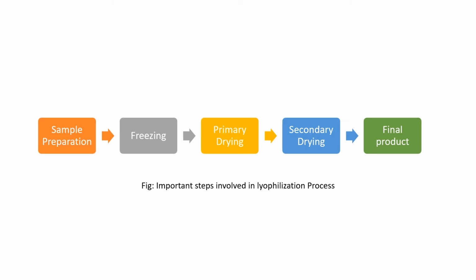Now see the primary drying. After pre-freezing of the product, ice can be removed from the frozen product via sublimation to form a dry, intact product. This primary drying, also called sublimation, is a slow process conducted at a cooler temperature, safely below the product's critical collapse temperature.